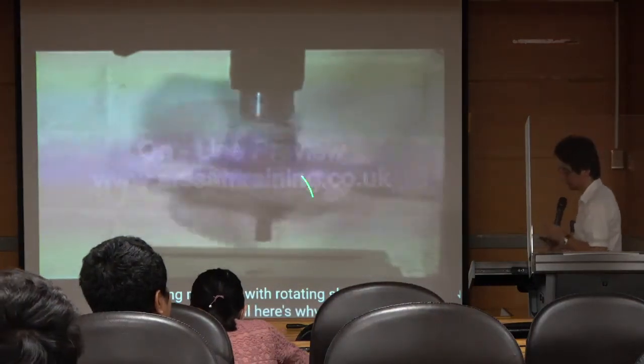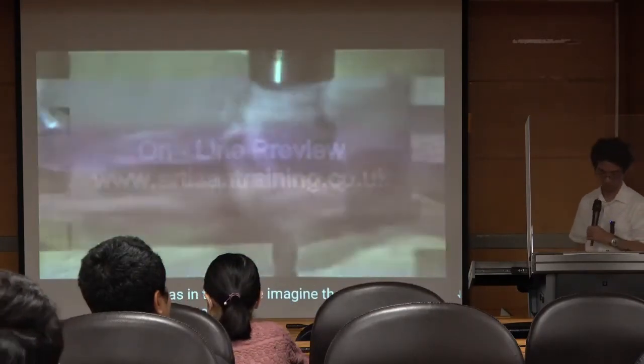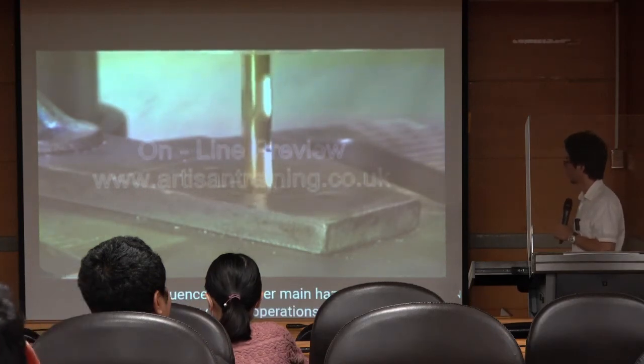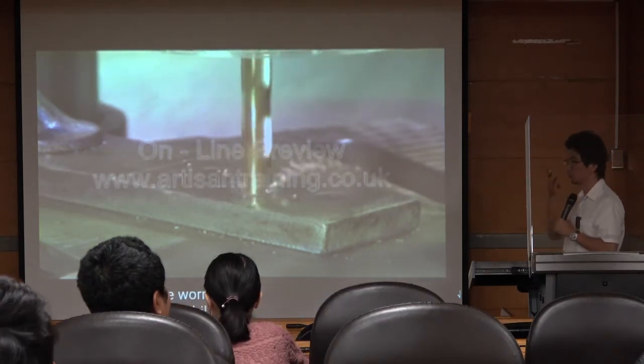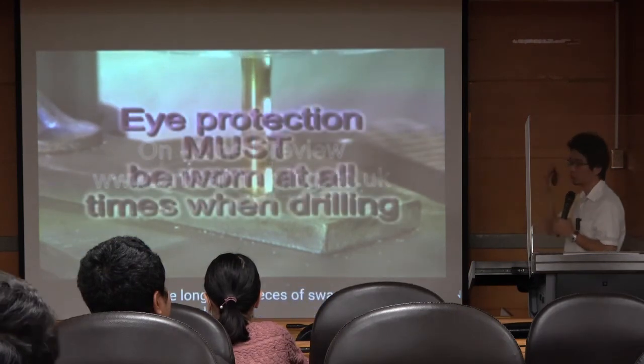You can see. If you don't wear the glasses, you should have the goggles for your eyes.